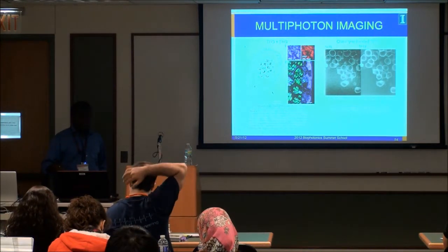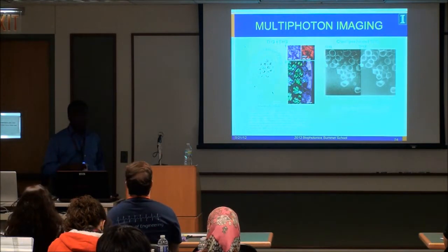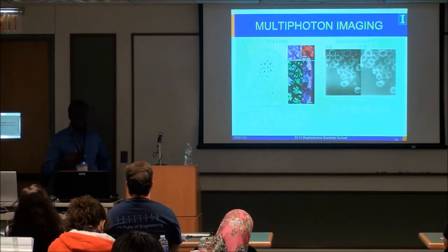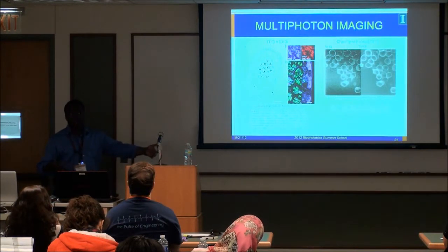It's more of a pain, perhaps, in aligning, but it's the direction where a lot of research is going. So if you can look at multiple things at the same time, which are derived from different mechanisms, the question is, well, why not do it? Well, it comes back down to just money and complexity.